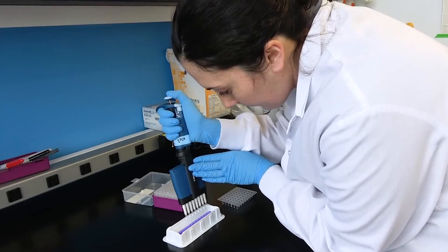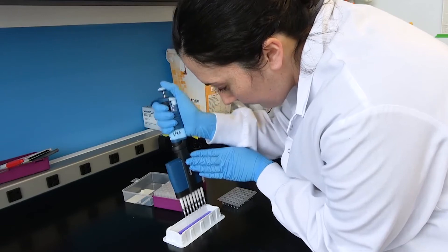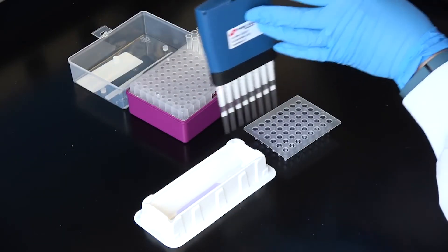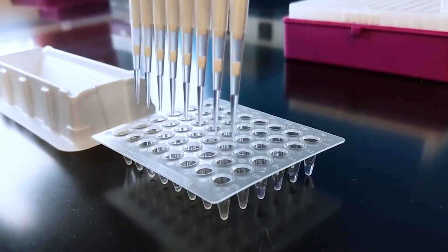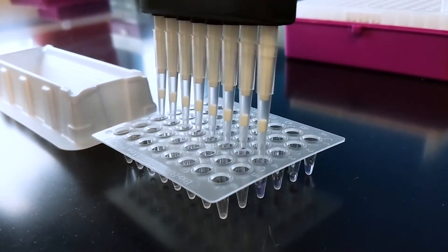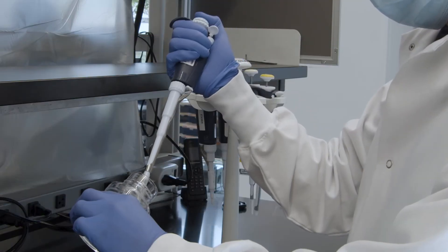What kind of pipette you will need depends on your experiment. This video will only be covering single-channel pipettes. If you're looking to improve your multi-channel pipetting technique, check out AdGene's protocol video on multi-channel pipettes. Back to single-channel. You'll want to select the pipette based on the amount of liquid you'll be pipetting.